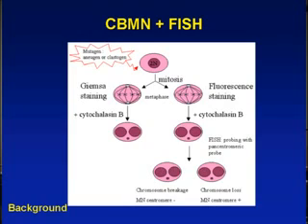So you can introduce the FISH technique, the fluorescence in situ hybridization. In this case, use a probe. The probe belongs to the centromere. I don't know if you can see those green dots inside the nuclear region. Those are the actual centromere. So if you have 20 pairs of chromosomes, theoretically you're going to have 20 dots there.